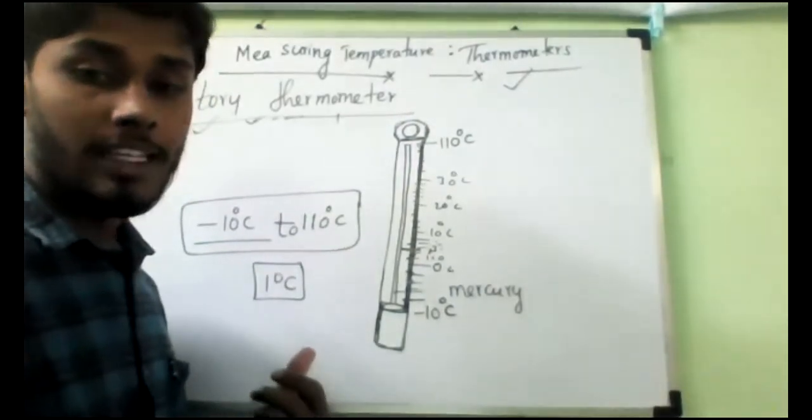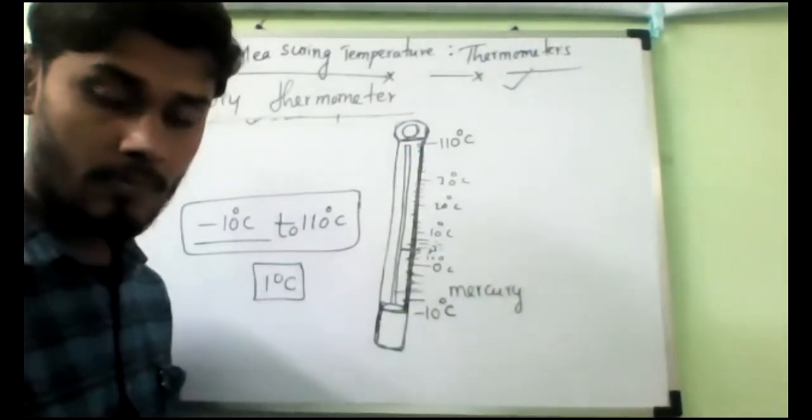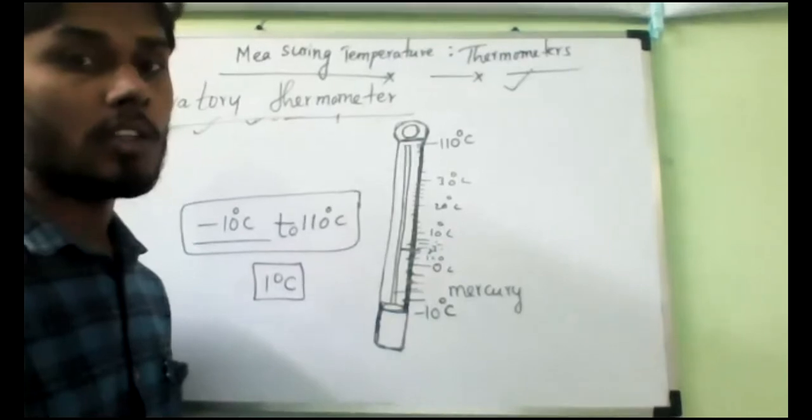Each division is indicating 1 degree Celsius. Yes or no? Yes, sir. That is what you should understand.